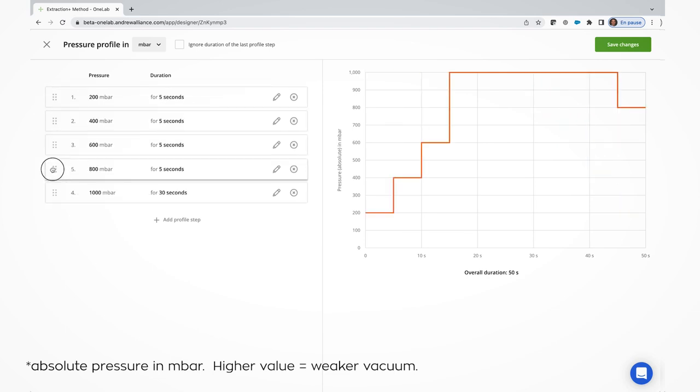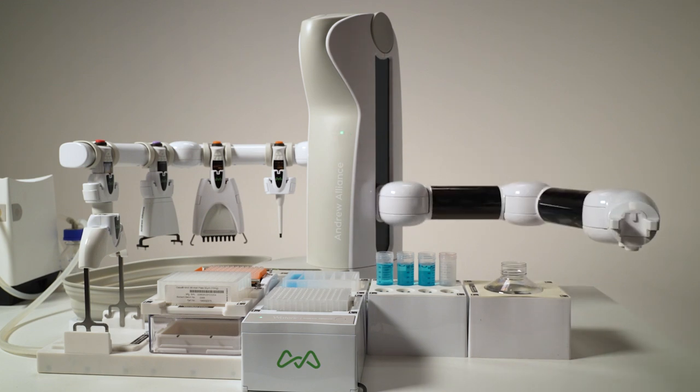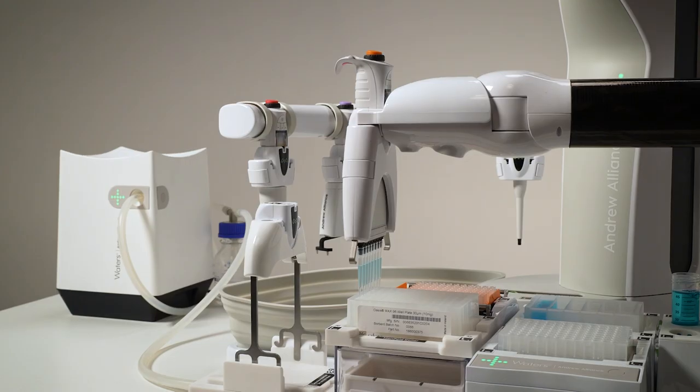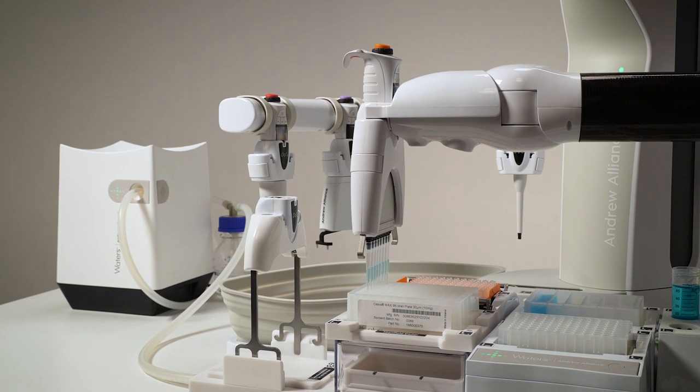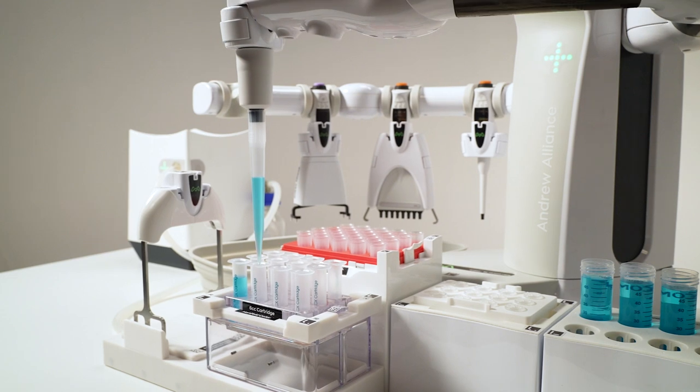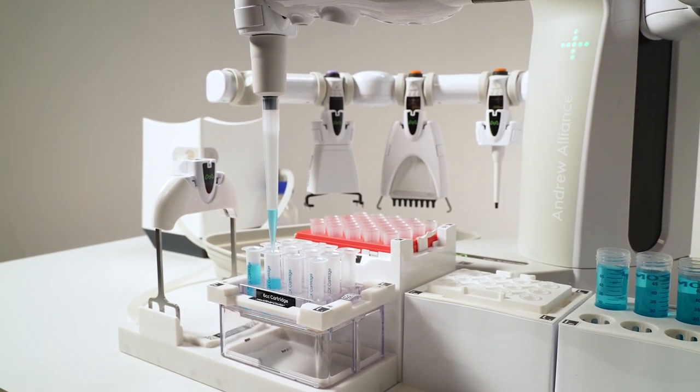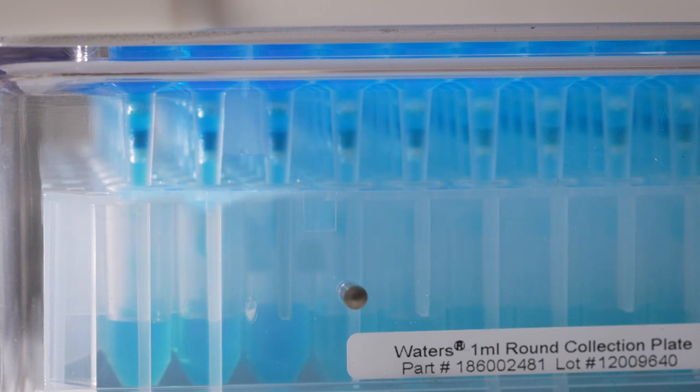Combined with the Andrew Plus robot, the Extraction Plus device is an all-in-one solution that fully addresses these critical requirements. Now, not only can we automate the tedious pipetting steps needed prior to and during extractions, like sample dilutions, normalizations, sorbent equilibrations, and washes, but these devices working in tandem also completely remove manual interventions like pressure settings and consumable movements as well.